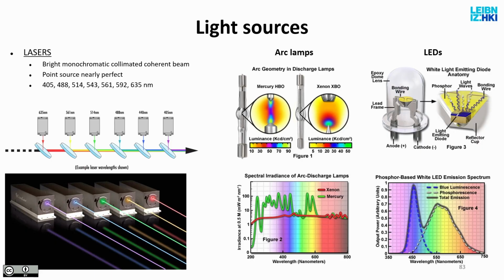Laser scanning confocals usually have lasers. Spinning disk confocals, which we will talk about in a minute, have both. LEDs have less power and they have a spectrum, so you must have a filter. Lasers are so monochromatic that you don't need an excitation filter for the cube. It saves you a lot of light. So you only need an emission filter but no excitation. Sometimes they put in a cleaning filter just to remove some noise, but you don't have to. With LEDs, you must. So we have to. That's the LEDs are cheaper. Okay.